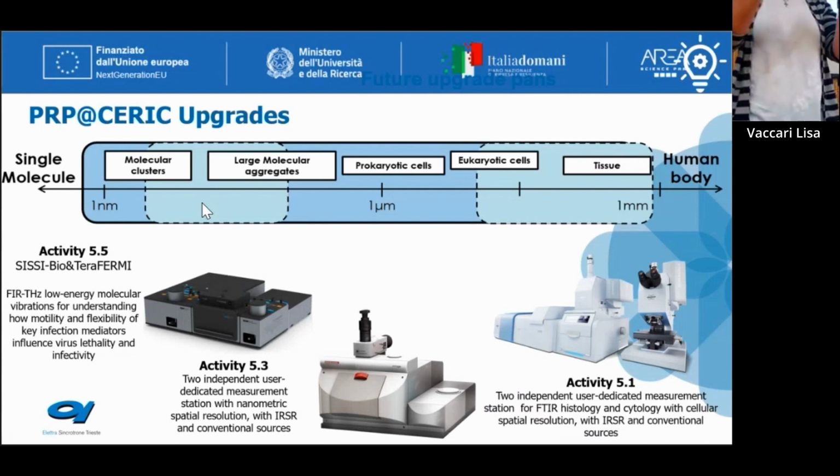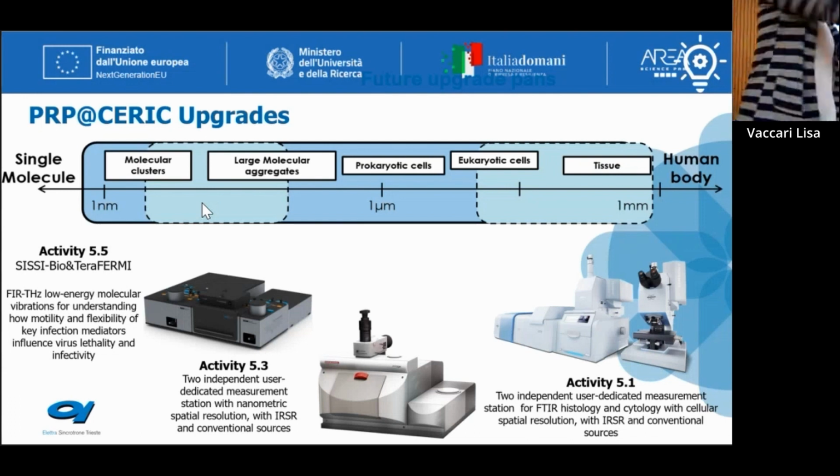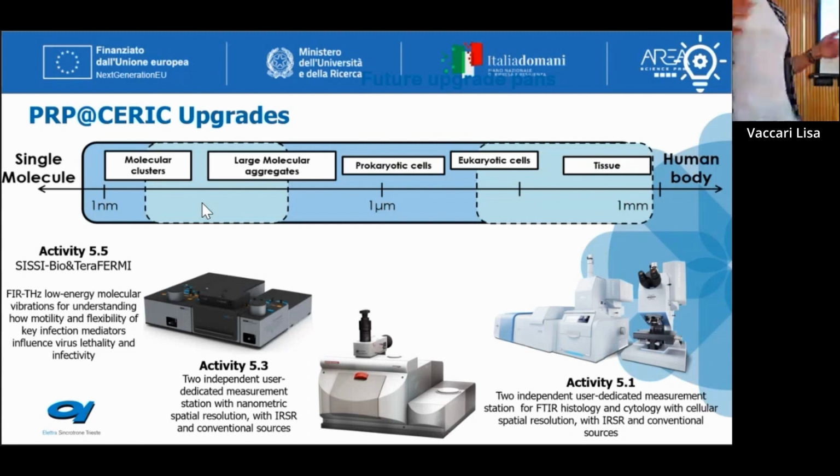This range of lateral resolution is closer to fluorescence microscopy, for example, a phenotyping approach mostly used by the HGB guys. So essentially we will have all the spectral resolution and the lateral resolution for characterizing the sample.